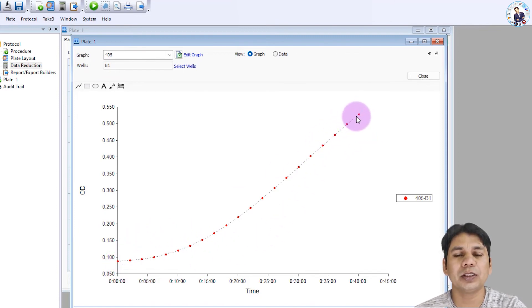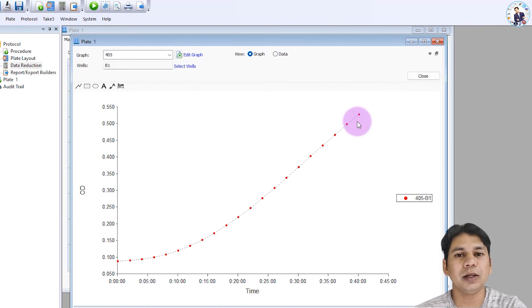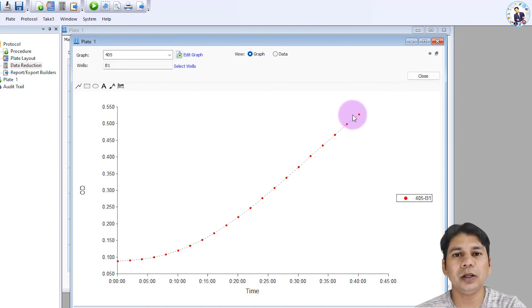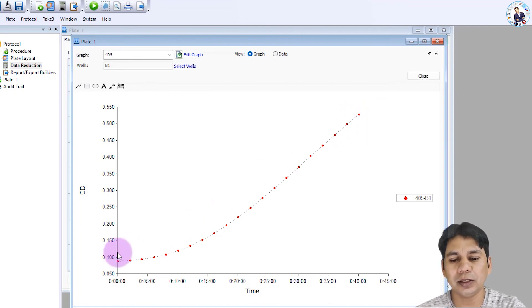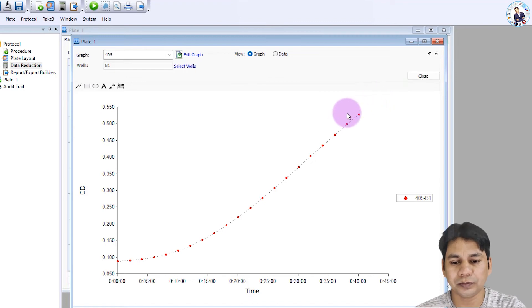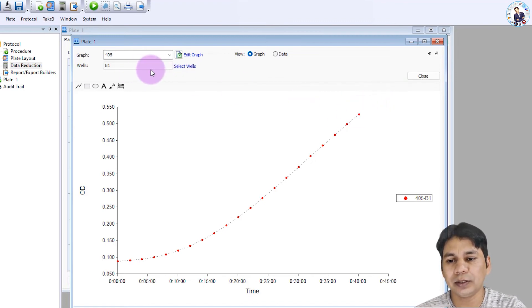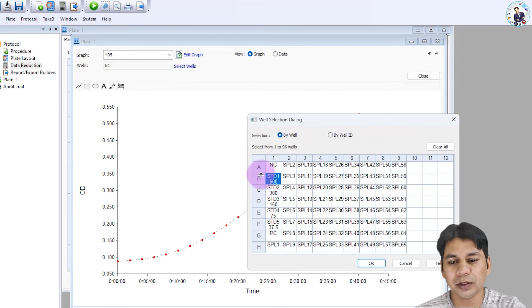For the selected well B1, you can see the absorbance values at different time intervals that we set during the protocol — 40 minutes and 21 absorbance reads for this clinical assay. You can also change the selected well to see the absorbance of other wells.